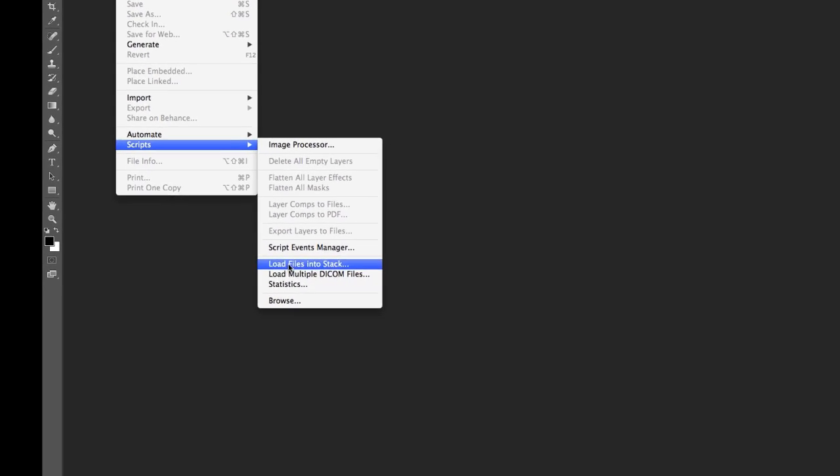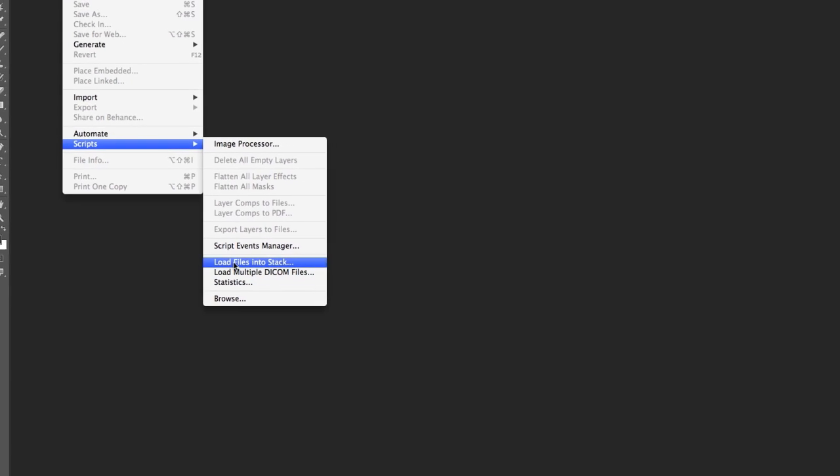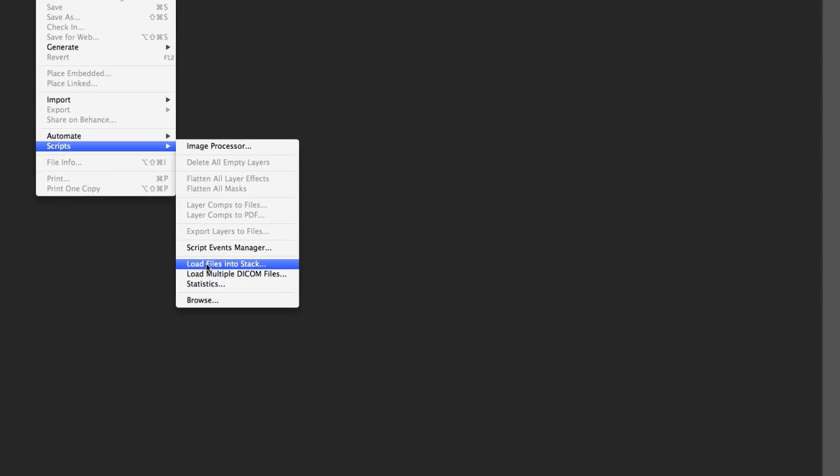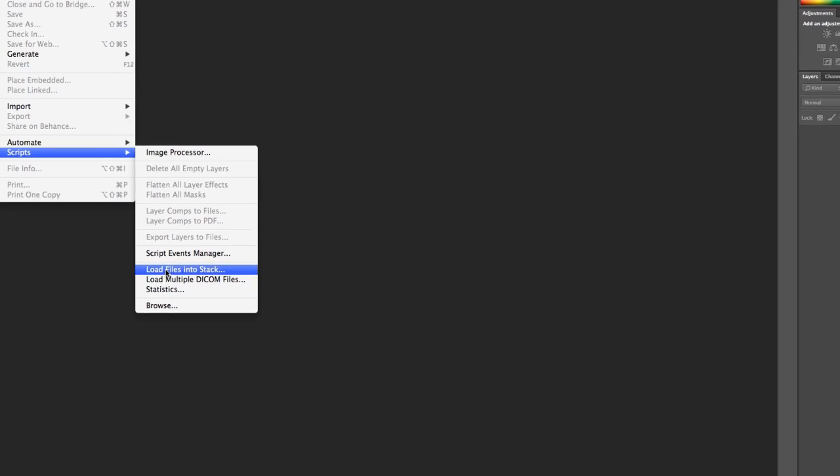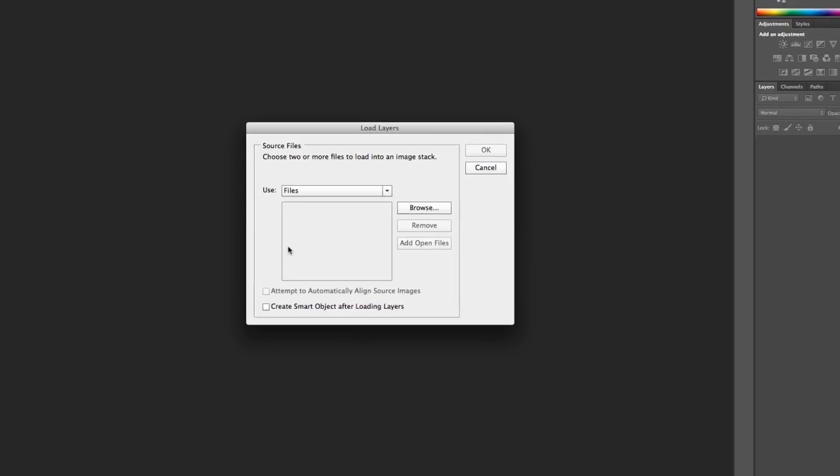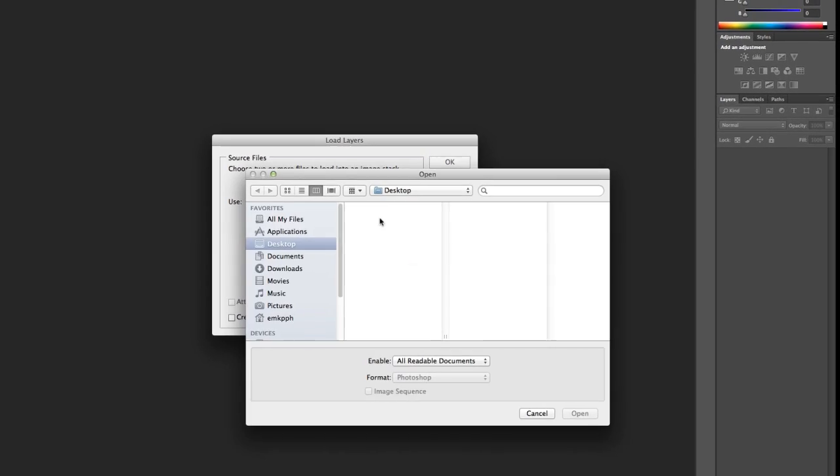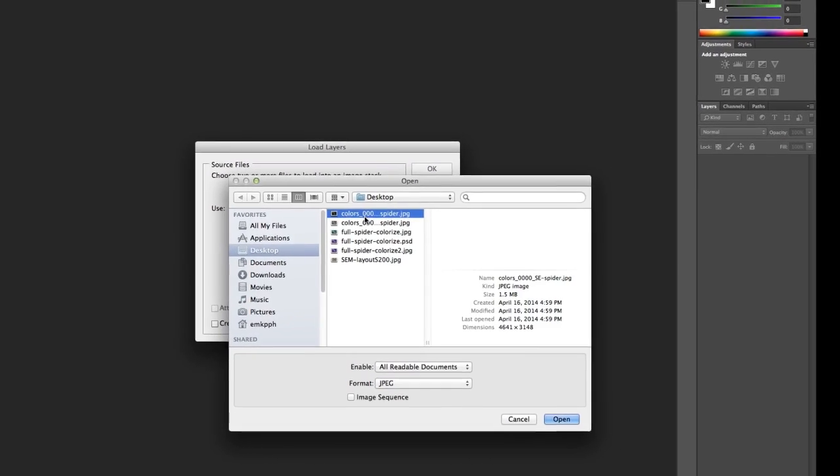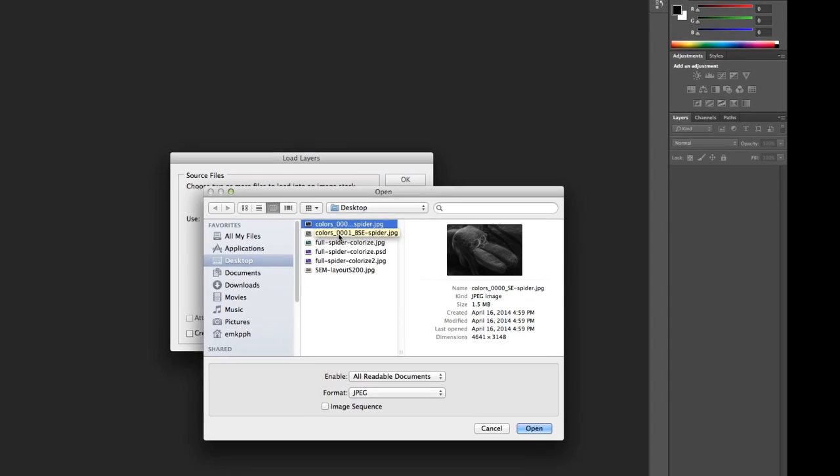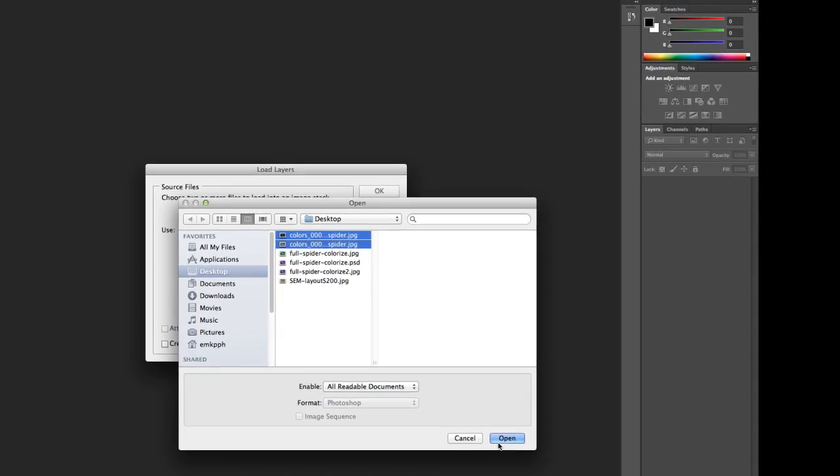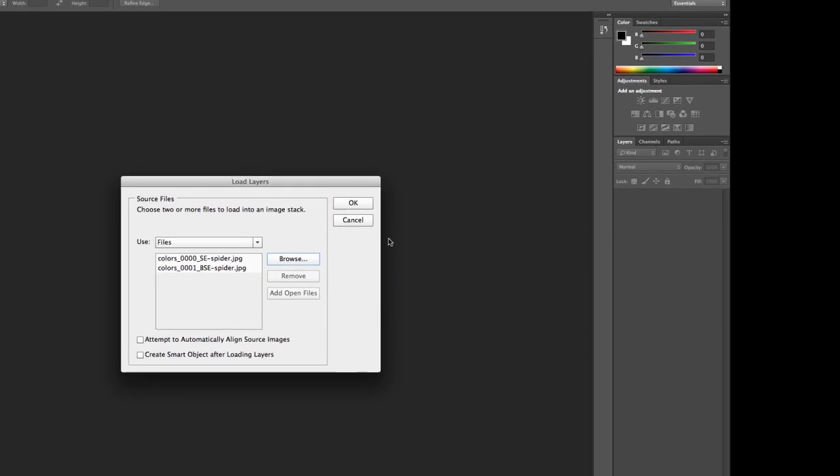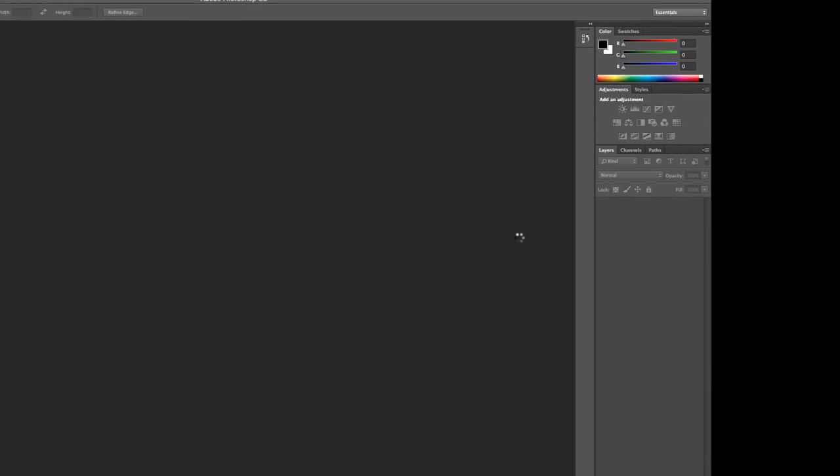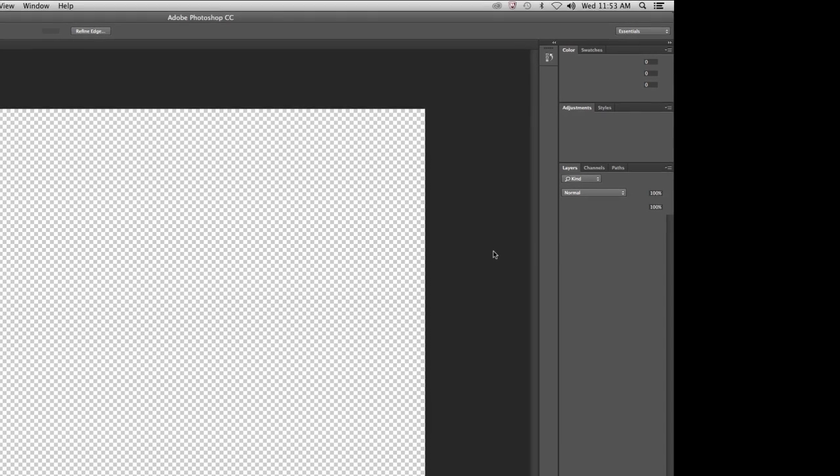So I'm going to take my two images, and these two images were collected under very similar conditions inside the SEM. These two images, I've kept them on the desktop, so I'm going to browse to the desktop wherever my images are. These two images are a secondary electron image and a backscattered image. I'm going to open those up. And this script, once I say OK, it's going to take these two images, and it's going to load them into two different layers in Photoshop.